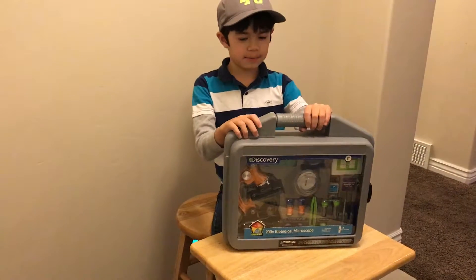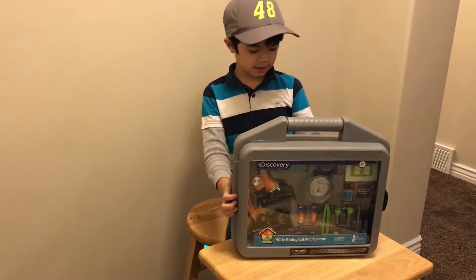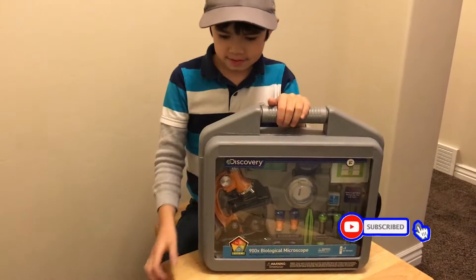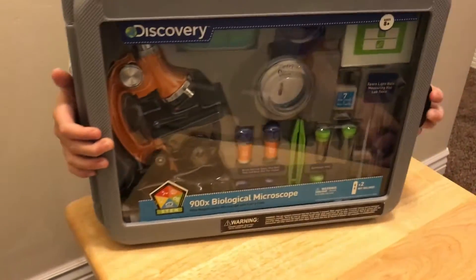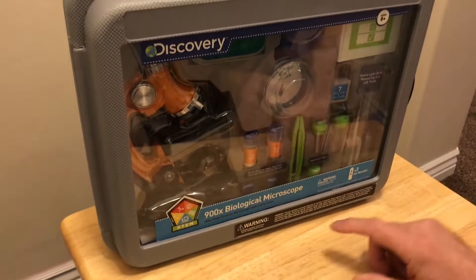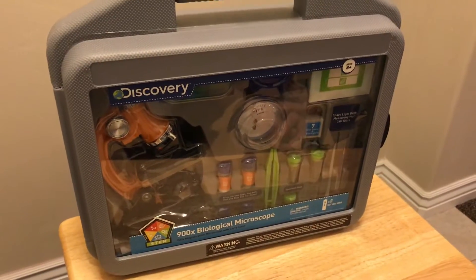Welcome back to RJ Play Play! Today we're opening this Discovery 900x biological microscope. RJ is going to do some science.